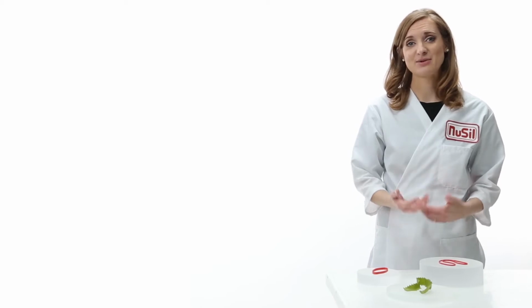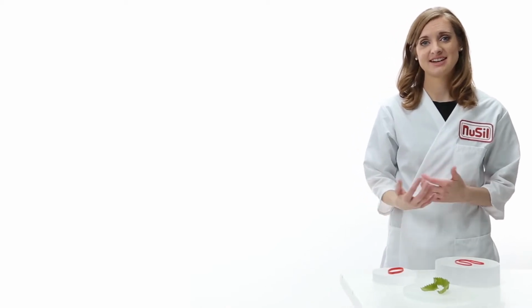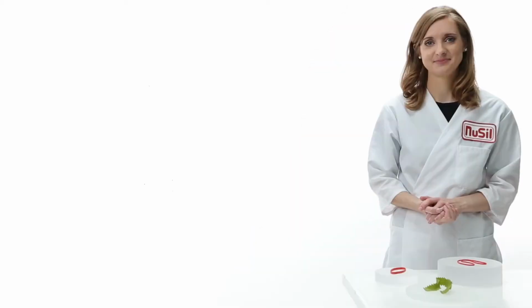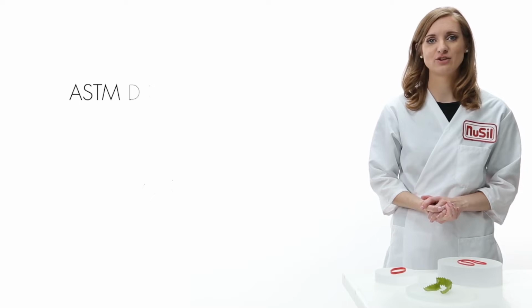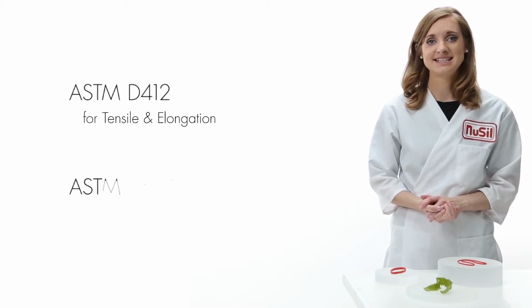Today we're going to talk about tensile, elongation, and tear. These physical properties are measured on cured material and are key to helping you choose the right NuSil silicone material for your application. At NuSil, we test using ASTM standard 412 for tensile and elongation and D624 for tear.